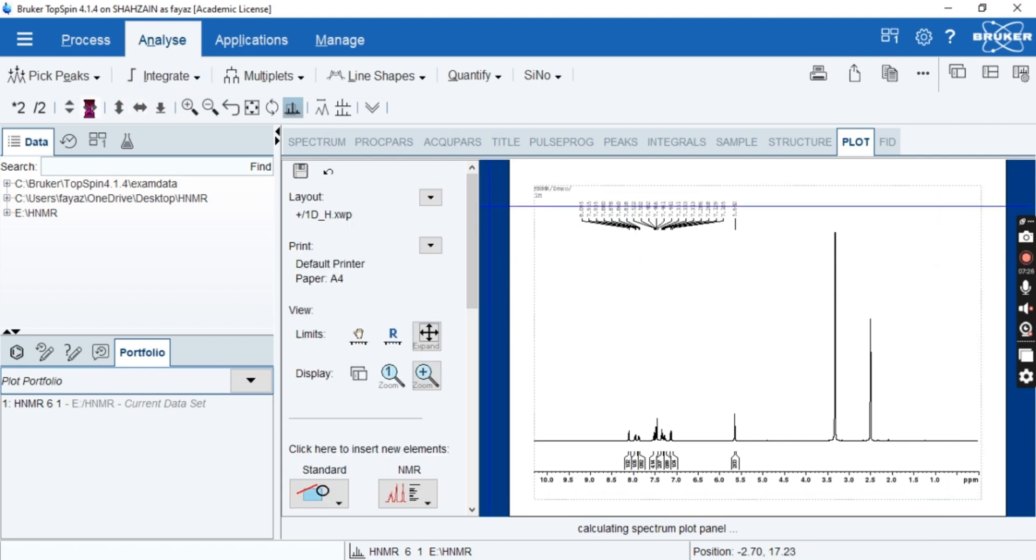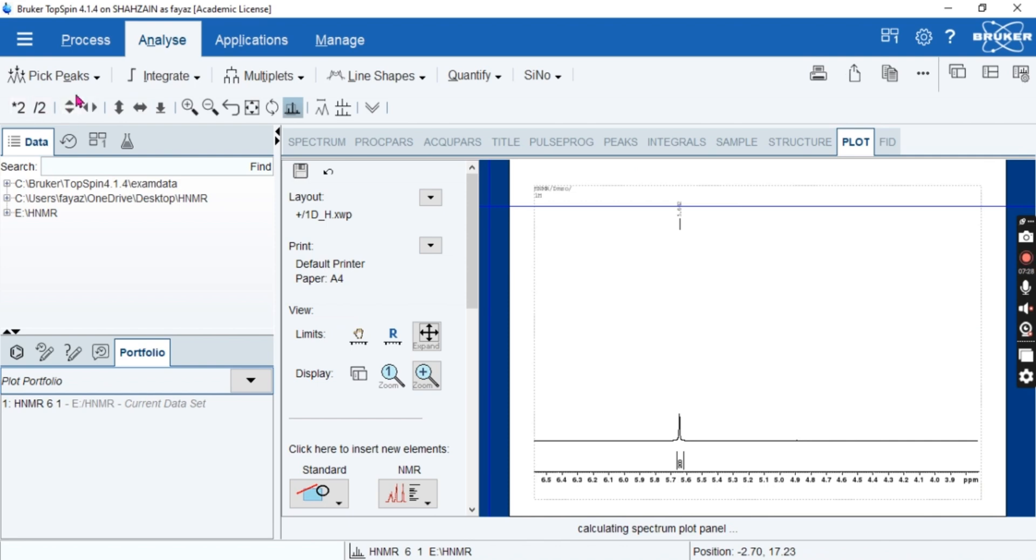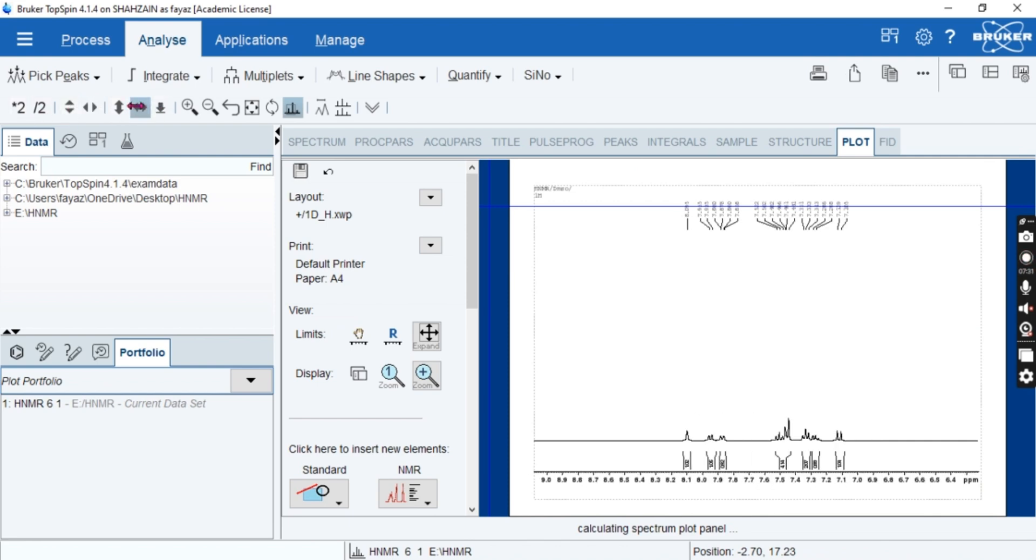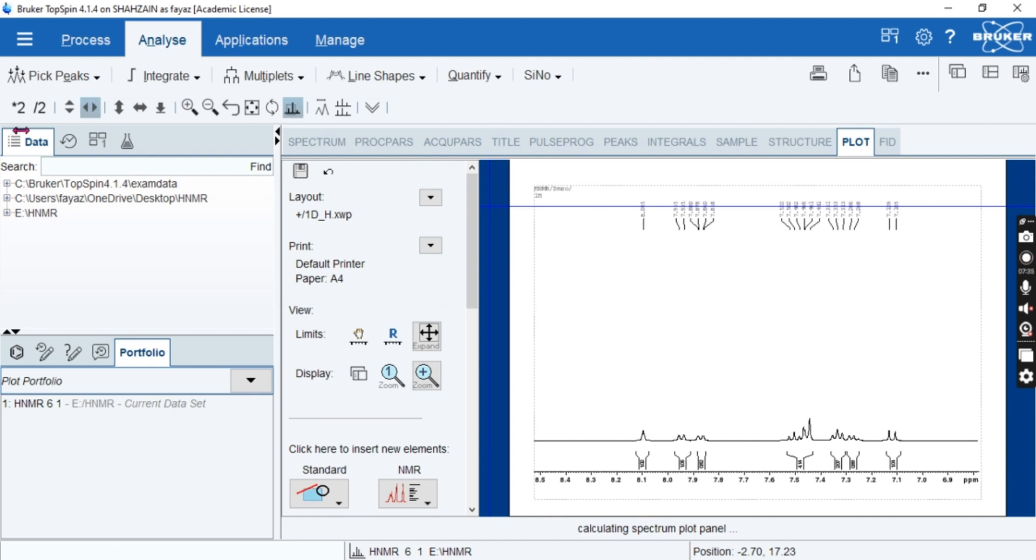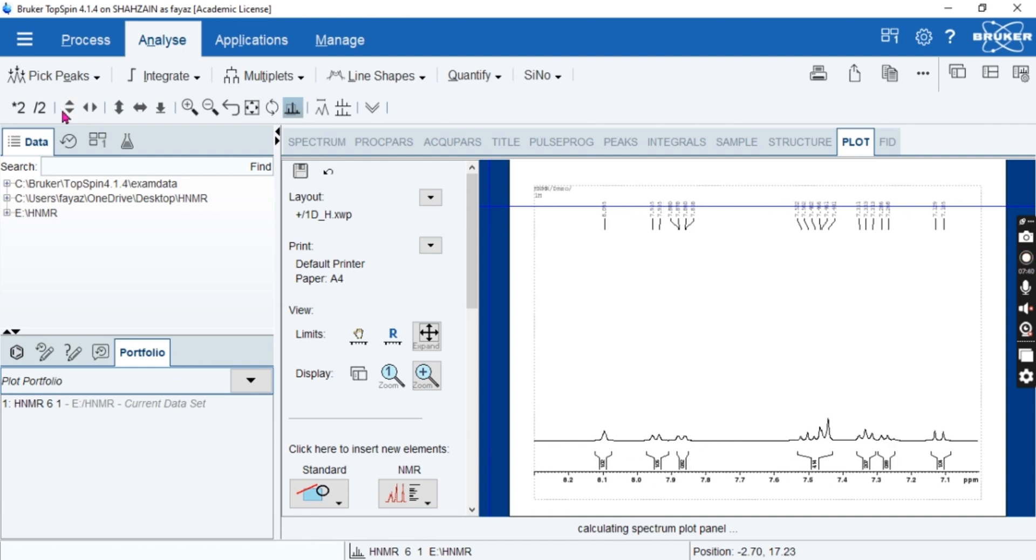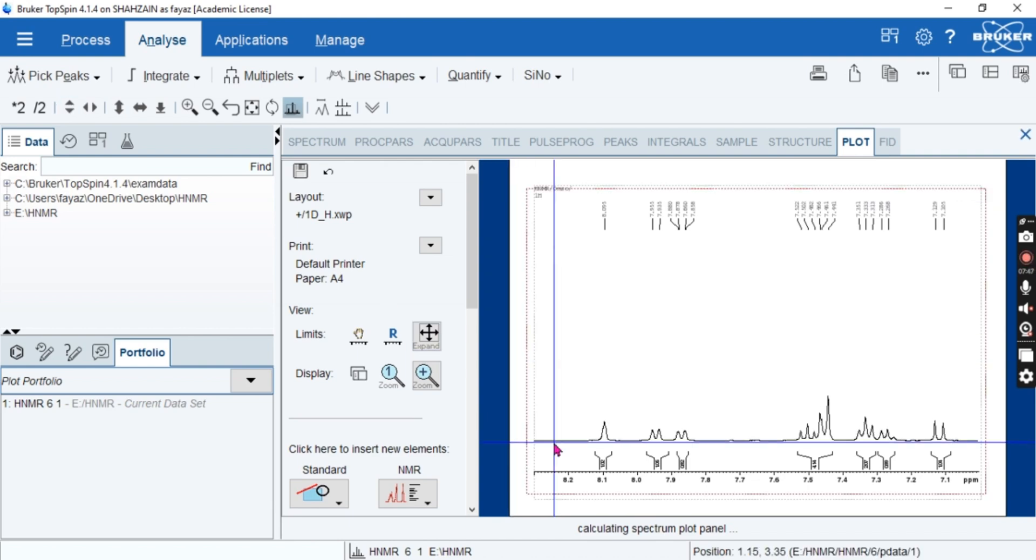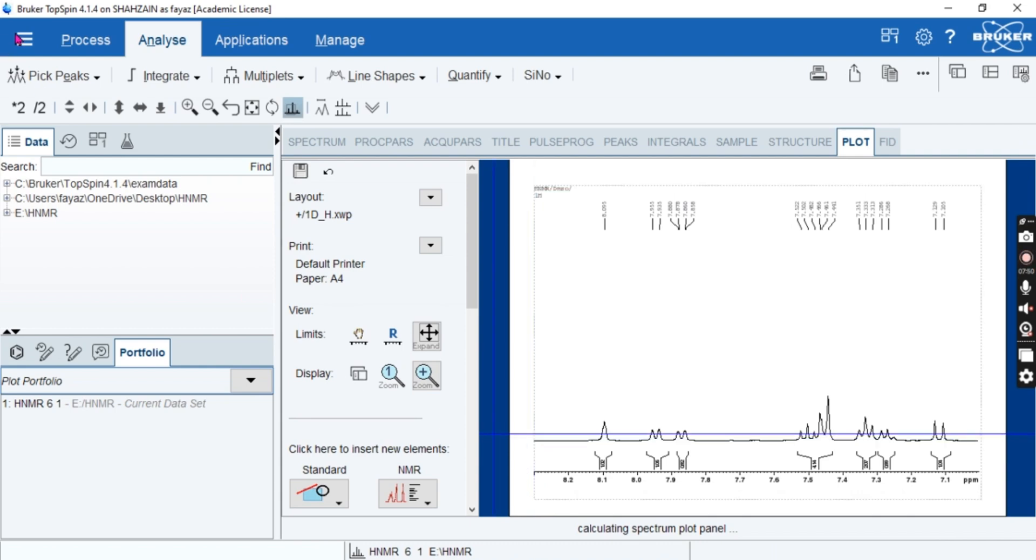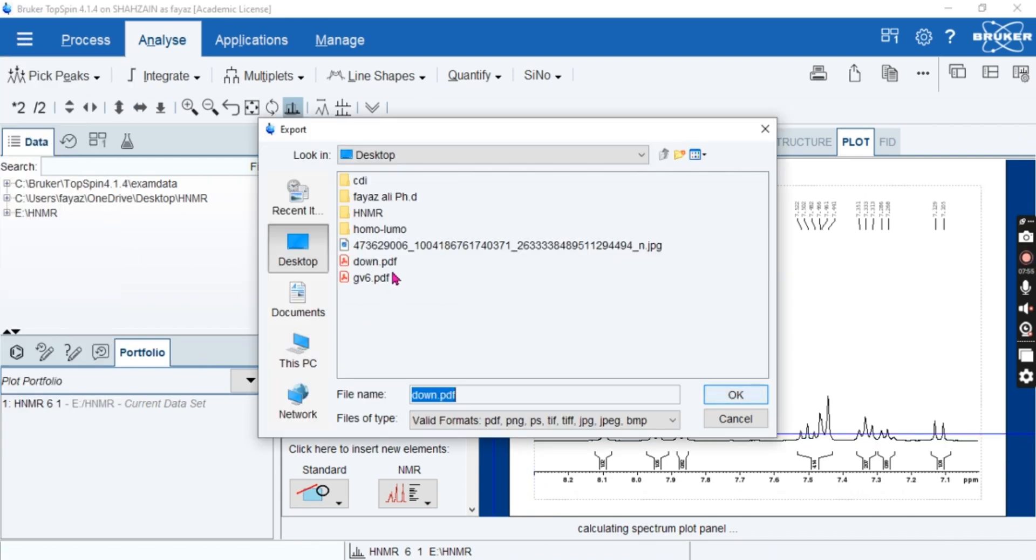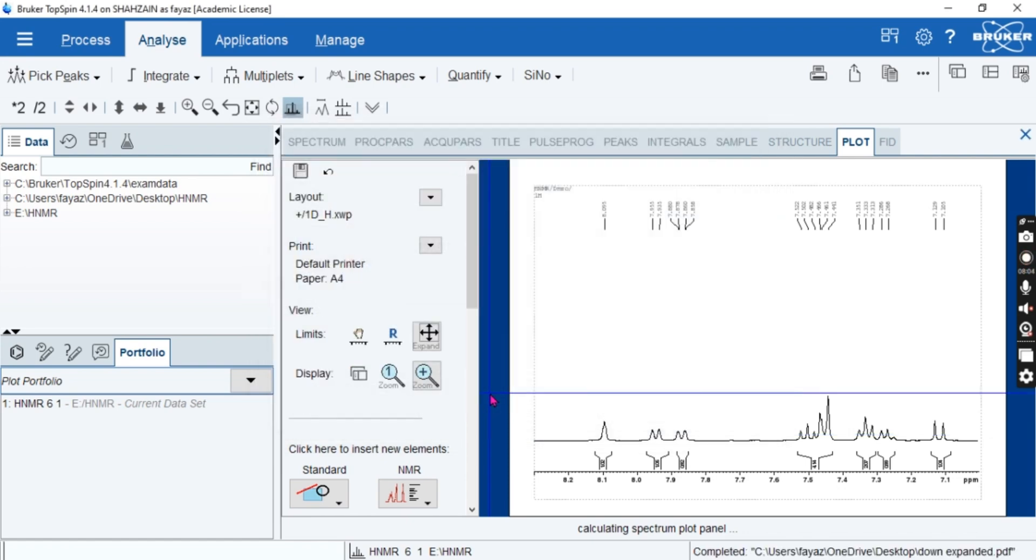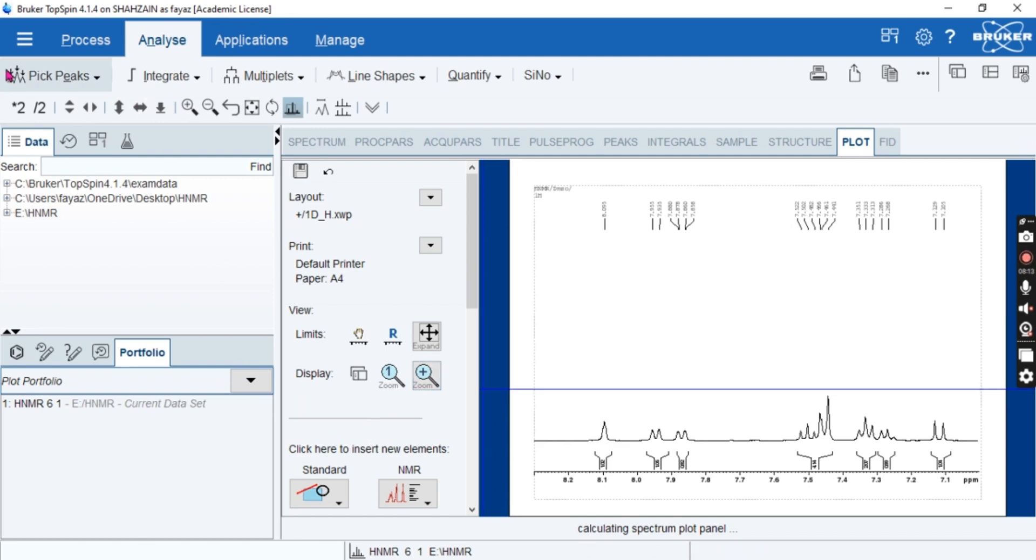Then we should delete, there is no need of expanded form. So this is the expanded, we expand and you can move this region and this is the move it. So I will expand it more to understand, okay I will increase. So depending upon you, you can save it as expanded form, download, and this is a PDF as the expanded form.